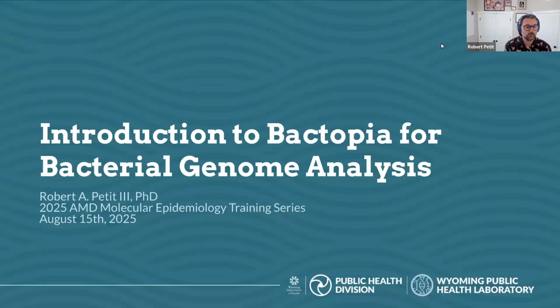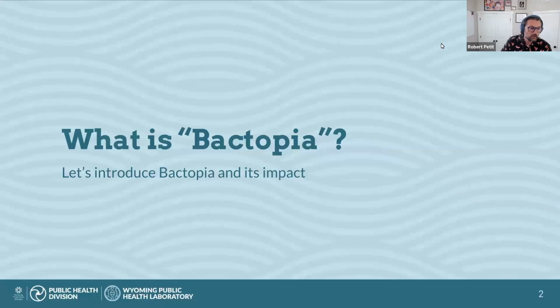Yeah, so today I'll be giving an introduction on Bactopia for bacterial genome analysis. To start off, I think it's probably important to ask: what is Bactopia? So let's go ahead and introduce it and kind of highlight its impact so far.